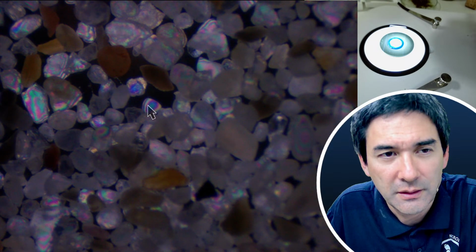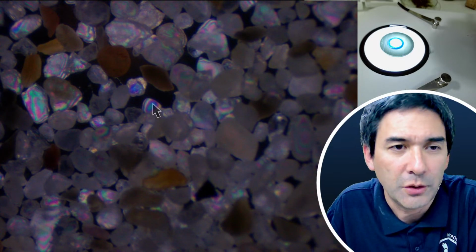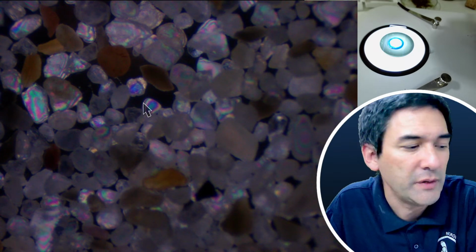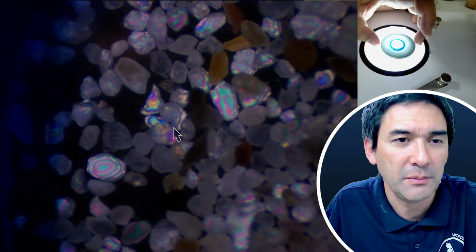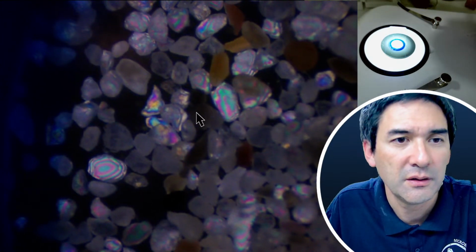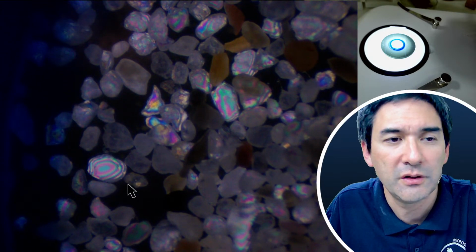Look, basically what happens is that many substances depolarize and they look bright then on a dark background. But sometimes the substances make nice rainbow colors as well. Like here. And this can tell you something, it could be that they're crystalline internally. You can see over here, there are these layers visible.